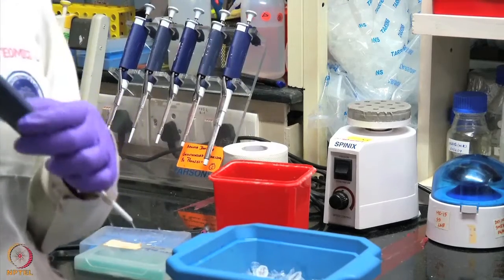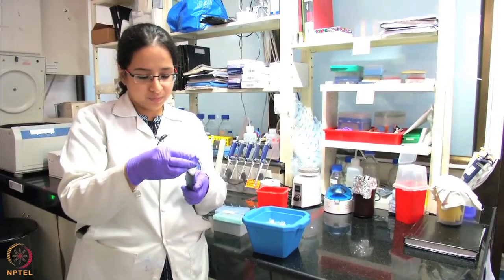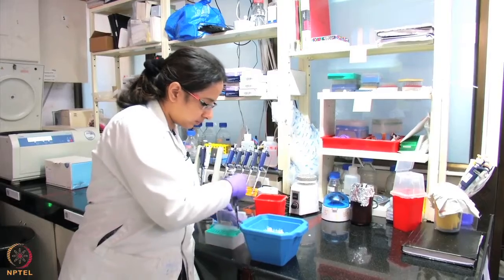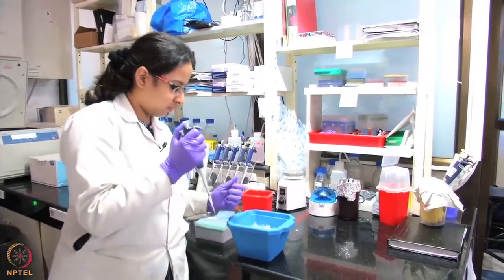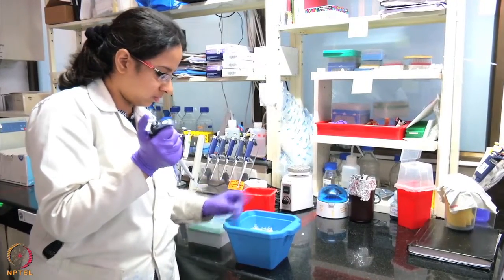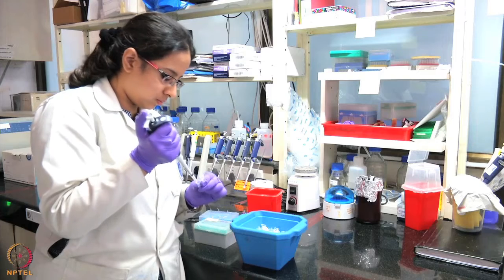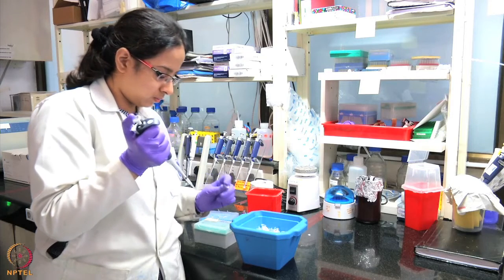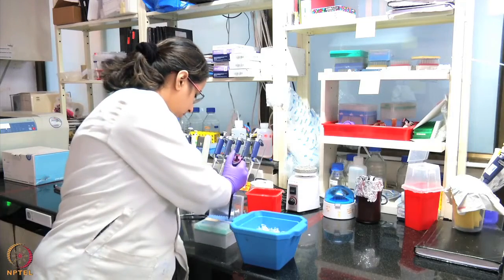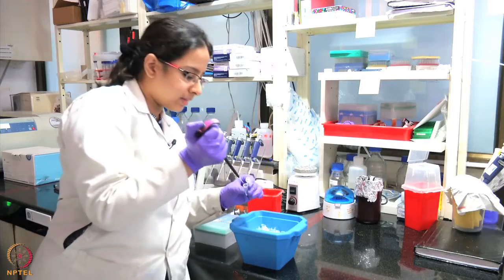I'm adding different volumes for each of the components, and accordingly I'm adjusting the pipette as well. Now I'm adding water. The last thing is the enzyme.